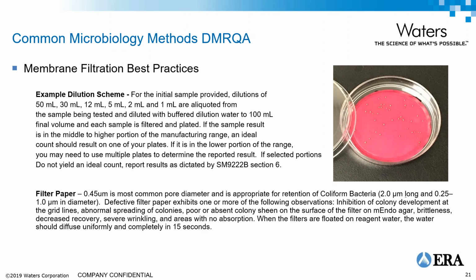Another way to check them is you can float them on reagent water. They should diffuse within about 15 seconds. If they continue to float and they never absorb, chances are there's something wrong with that filter paper.